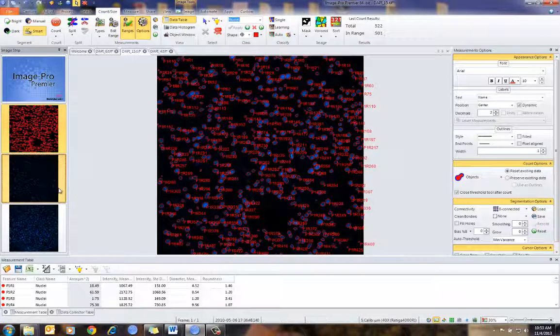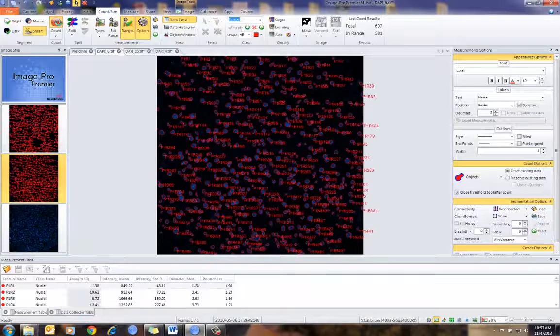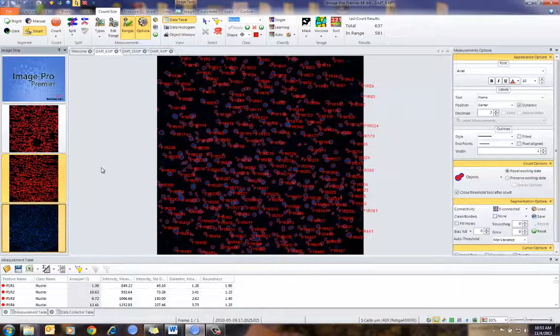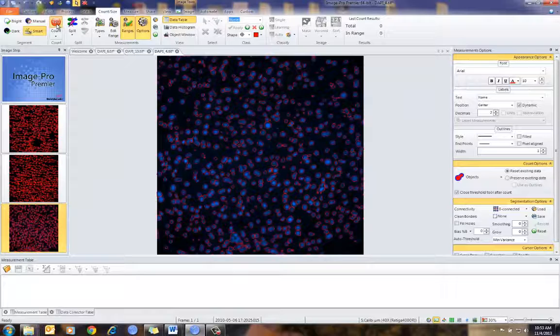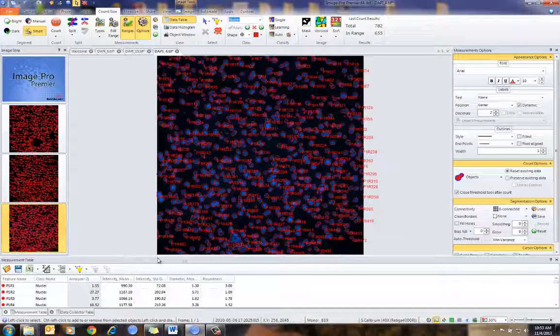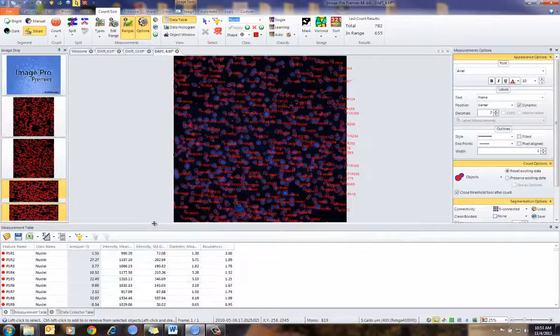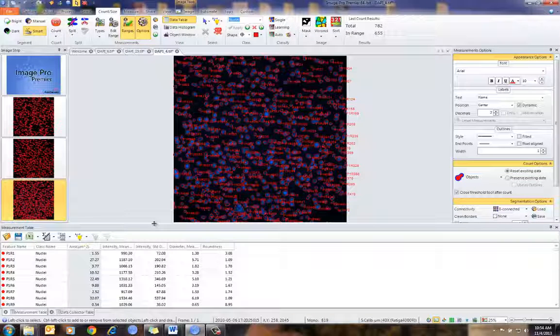I can go to my second image and count, and then finally go into my third image and count. At this point, I have all of my data in Data Collector from three images. All I've had to do is simply press the count button by having Data Collector set up for automatic collection.